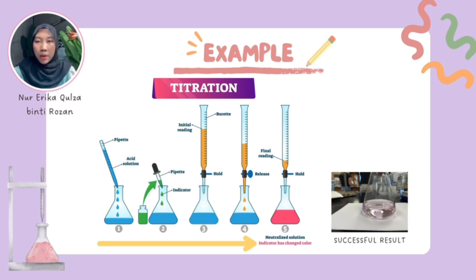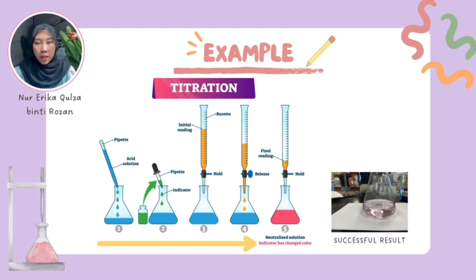We then fill a burette with the base solution of known concentration. It is important to ensure there are no air bubbles in the burette. We note the initial reading of the burette, which will be used to calculate the volume of base added during the titration. We slowly release the base solution from the burette into the acid solution while continuously swirling the flask. We need to add the base slowly, especially as we approach the endpoint, to avoid overshooting.